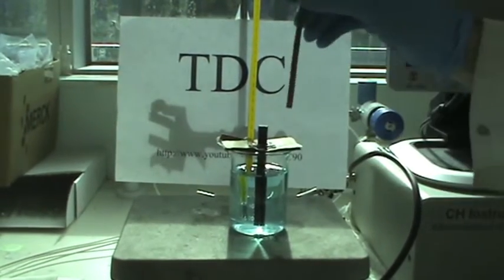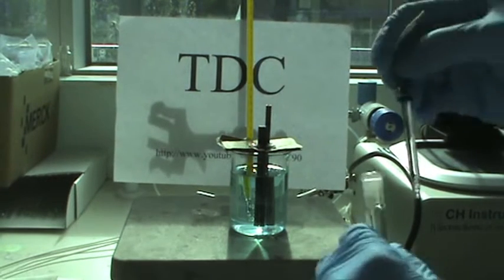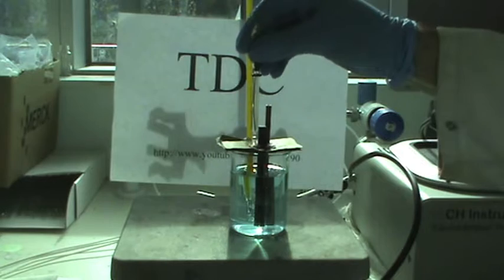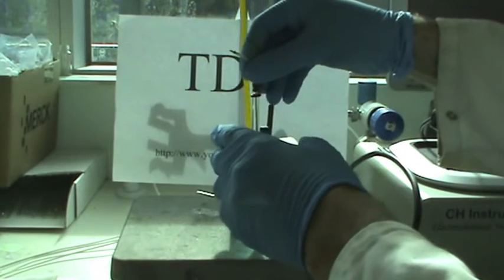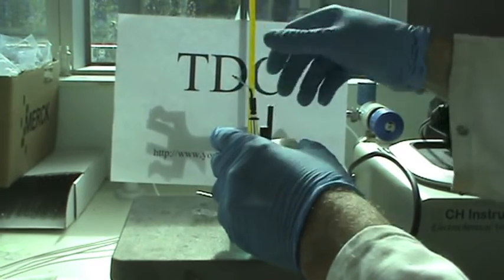Followed by the copper rod counter electrode to the top right side of the cell, and then the silver-silver chloride reference electrode to the upper left side of the cell, making sure the distances of the electrodes are around 0.5cm apart.